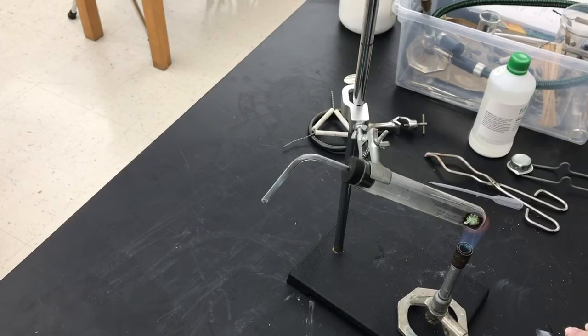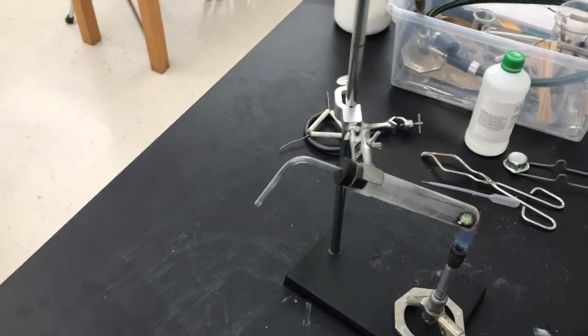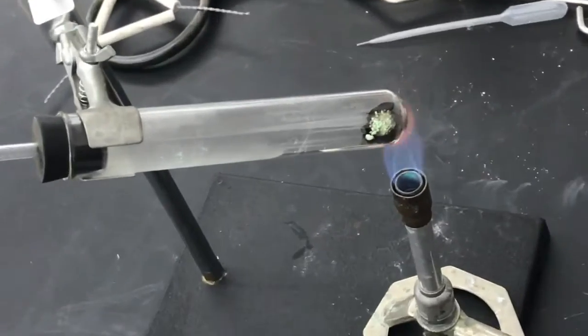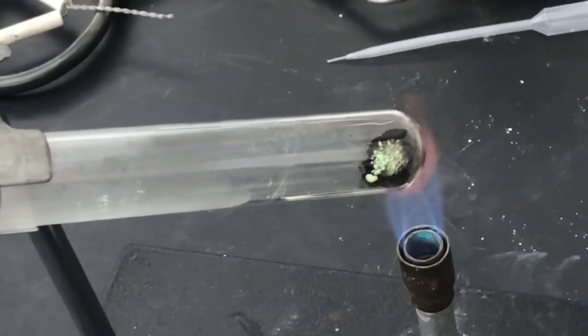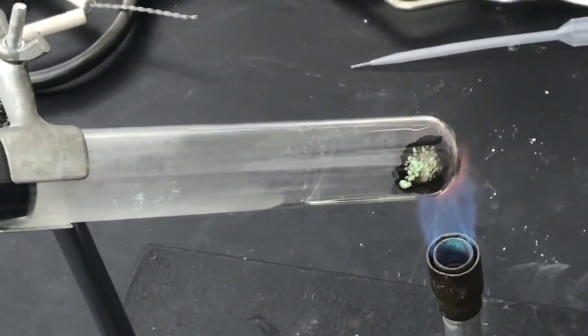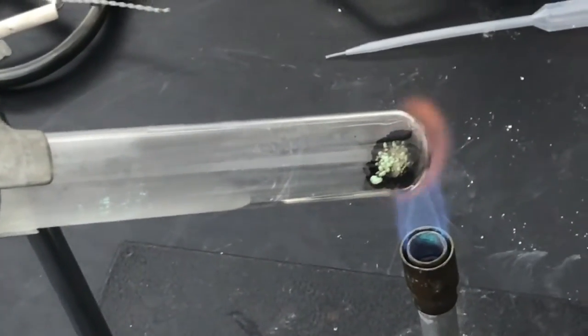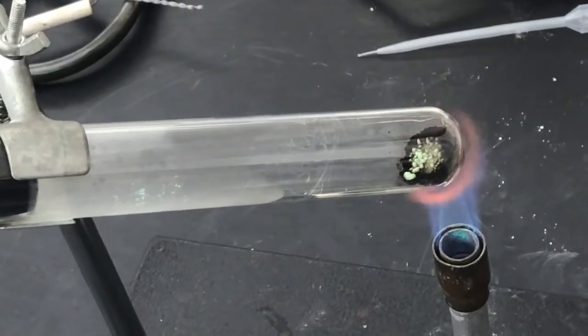Now, what's left behind? Let's zoom in on that a bit. You can probably see it does not look much like copper. Again, it sort of looks like it's burnt or has burned up. Again, it's not really burned, but it has reacted.